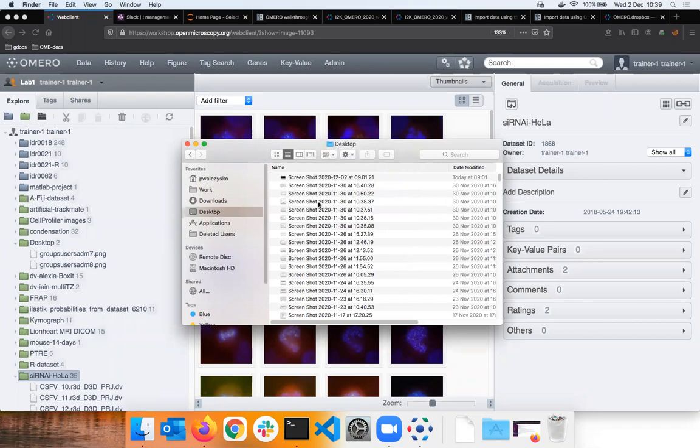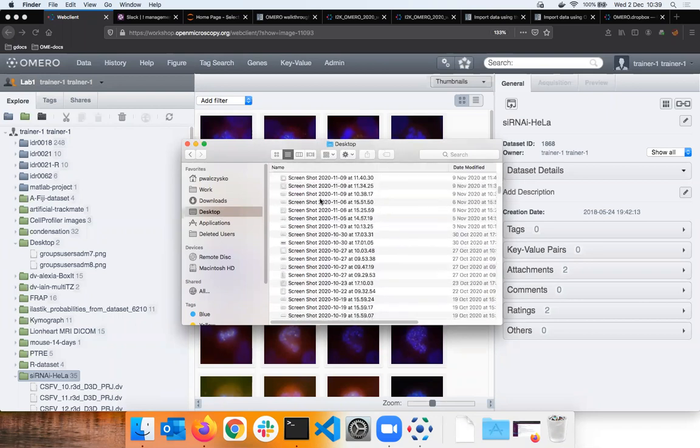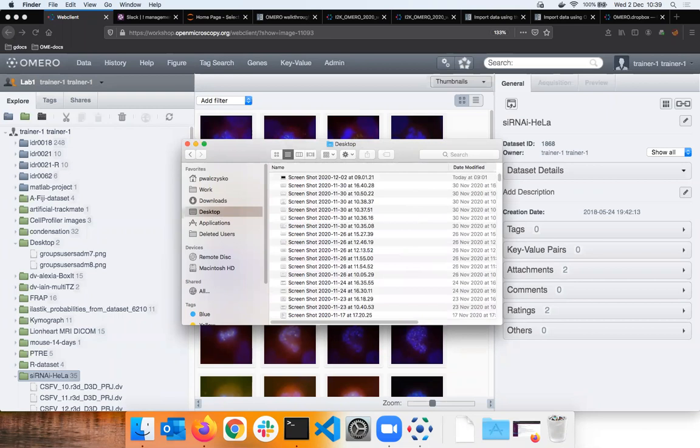If I were on your Samba, on a big server where your users are, there would be a root folder with the users, and under users a subfolder for each user, and there could of course be further subfolders.